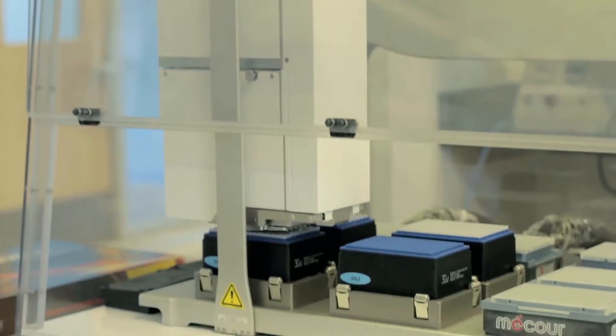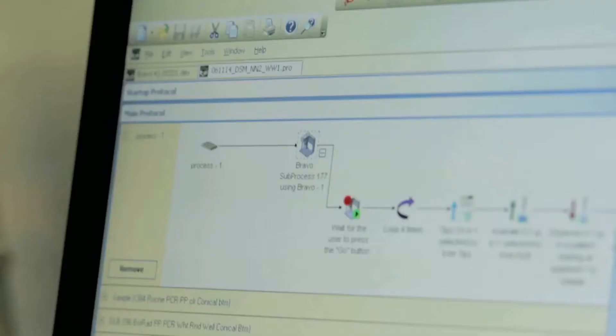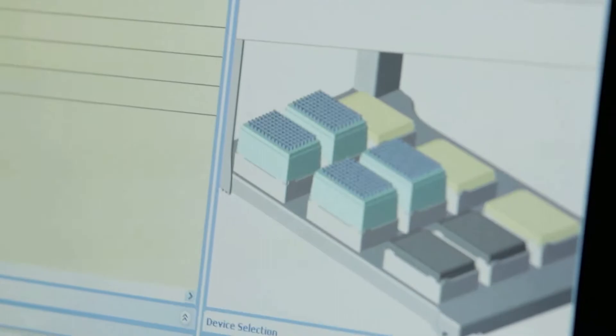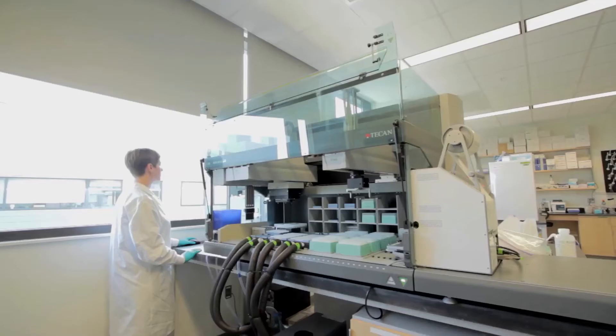Robotic liquid handling is employed for contamination-free processing of thousands of individual cell reactions simultaneously. The success of genomic amplification is gauged by monitoring the fluorescence of a DNA stain in each single cell reaction. We call the product of this reaction a single amplified genome, or SAG.